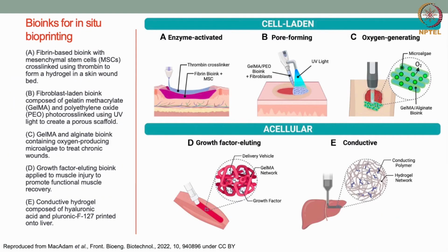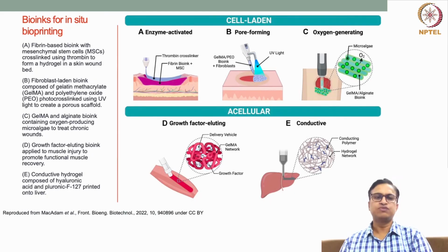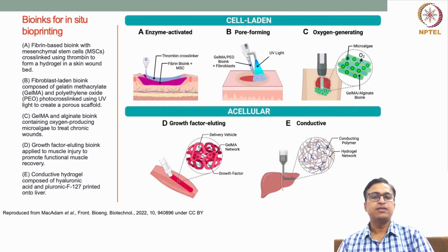Let us now discuss the different bioinks that have been used for in situ bioprinting. So please remember, these bioinks are already being used for conventional bioprinting, where they have been used for different applications, and also different types of gelation mechanisms or strategies have been used.